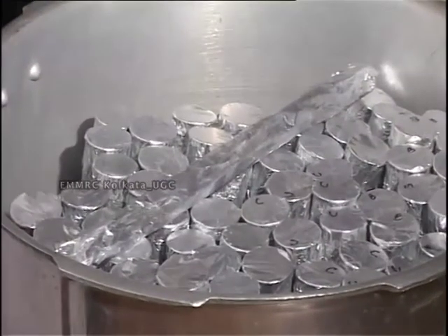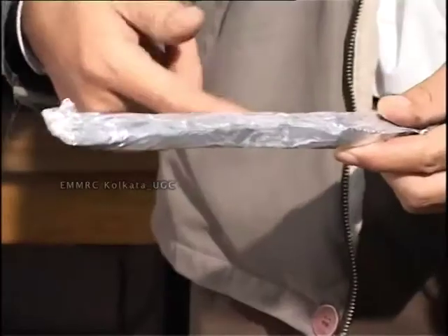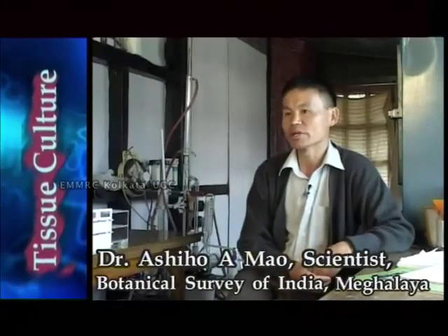Autoclave is not the only solution for sterilization. There is an alternative. A pressure cooker is the same thing, the basic principle is the same as this autoclave. There you cannot put so much equipment, or prepare media in large quantity. But if you have a 5-liter pressure cooker, you can prepare maybe 1 liter at a time, or put a few equipment, whatever you want. Or you can do it 2 times: all the equipment is sterilized once, then the media separately. That way you can do it.